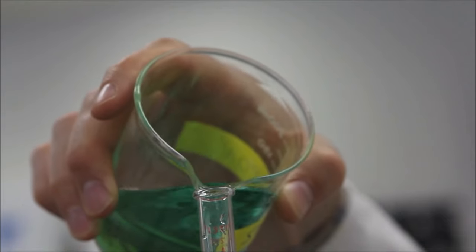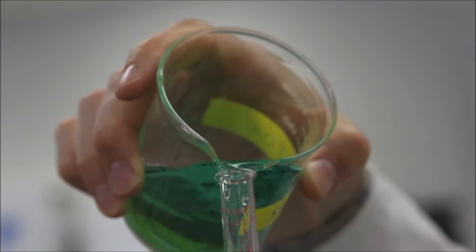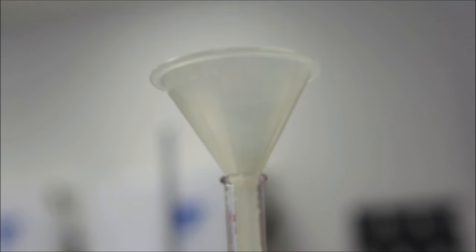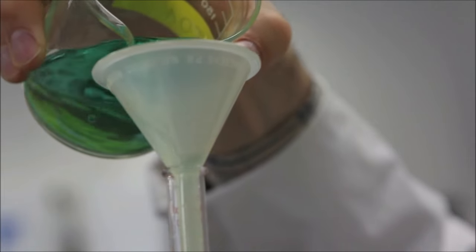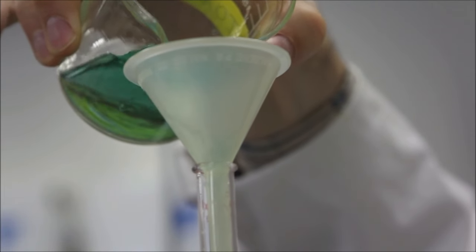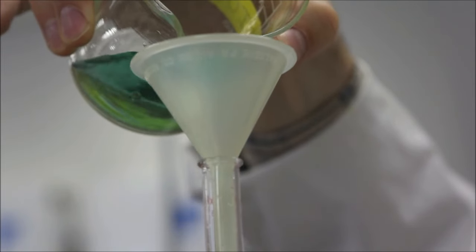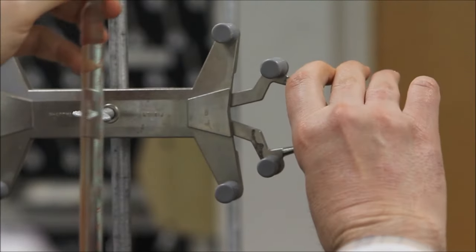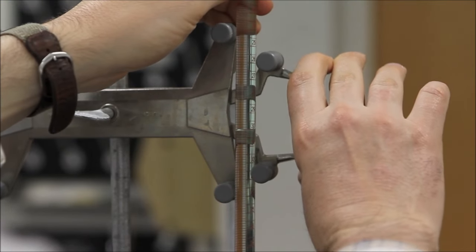To fill the burette, you may choose to either pour your solution from your small container into the top of the barrel. Alternatively, you may decide to use a small funnel inserted into the top of the barrel to make this process a lot easier and certainly a lot less error prone. Either approach is perfectly okay, but if you decide to use the funnel, please remember to remove it before continuing. Once it is filled, secure the burette in the upright position using the burette clamp.